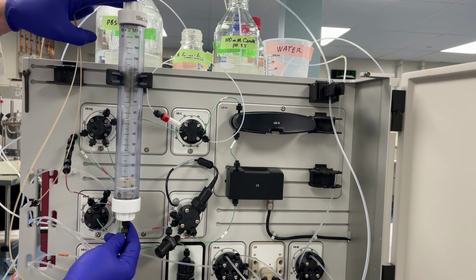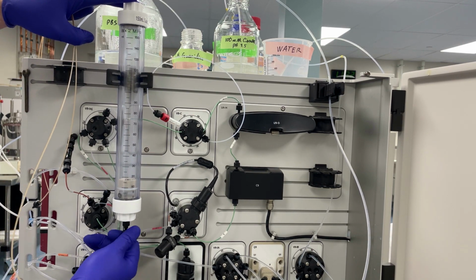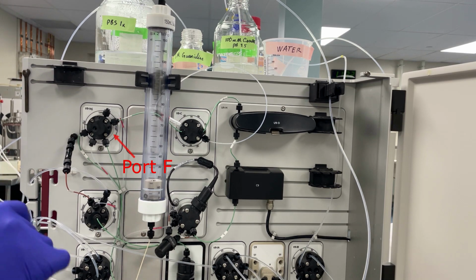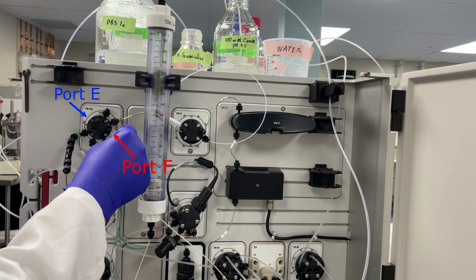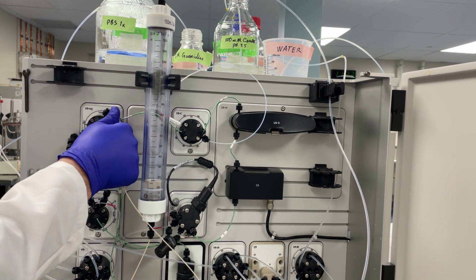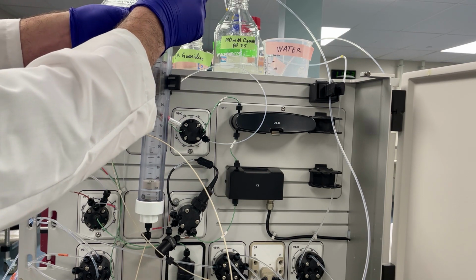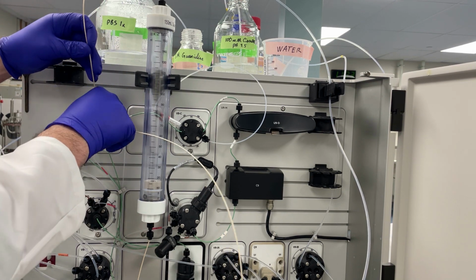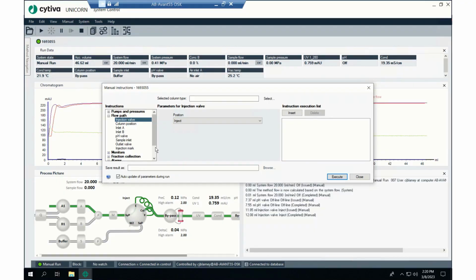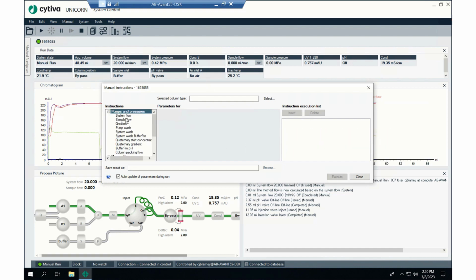It's very important that you plug the super loop in properly. The instruction booklets show you that the bottom of the super loop is plumbed into port F on the part of the injection valve, and the top of the super loop is plumbed into port E of the injection valve. Then we're going to have to run the stopper in the super loop up and down several times to get all of the air out of it. Then we'll load cell harvest onto it. So when the stopper's all the way at the bottom, we're going to stop the flow from the system.